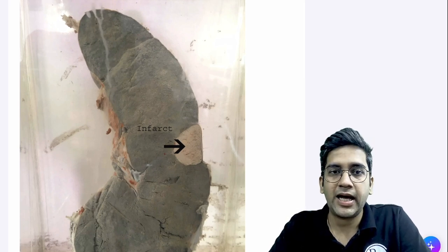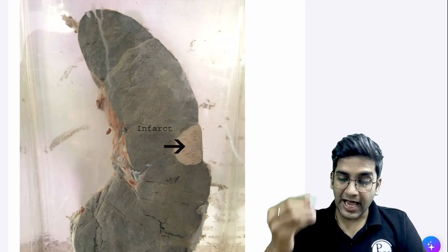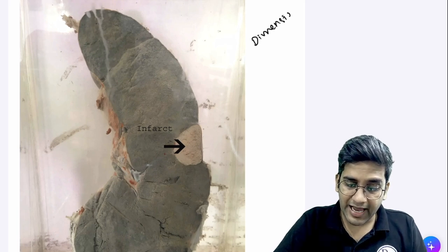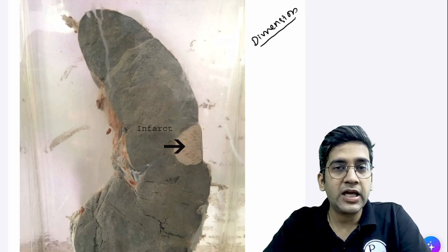Second, I like to describe the cut surface of the spleen. Before going to the cut surface, as usual like I said, always mention the dimension. In the last video we had discussed about fatty liver. Like I said, you need to know a little bit about the normal architecture or the size.